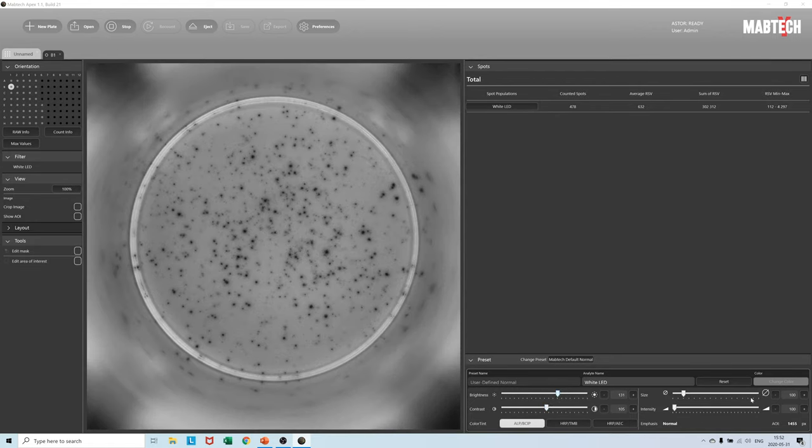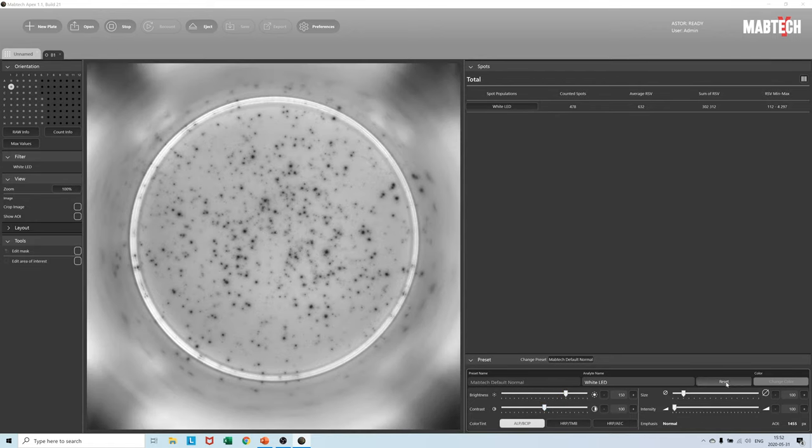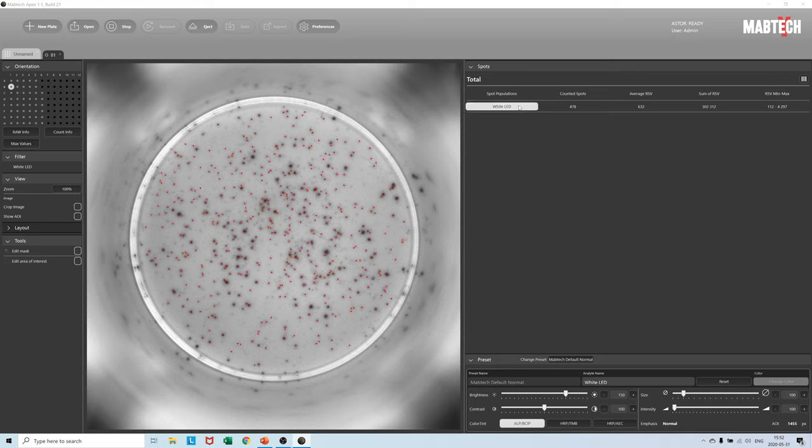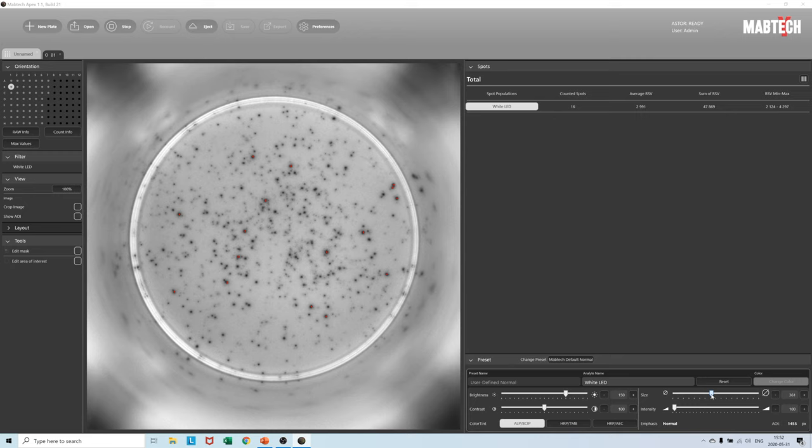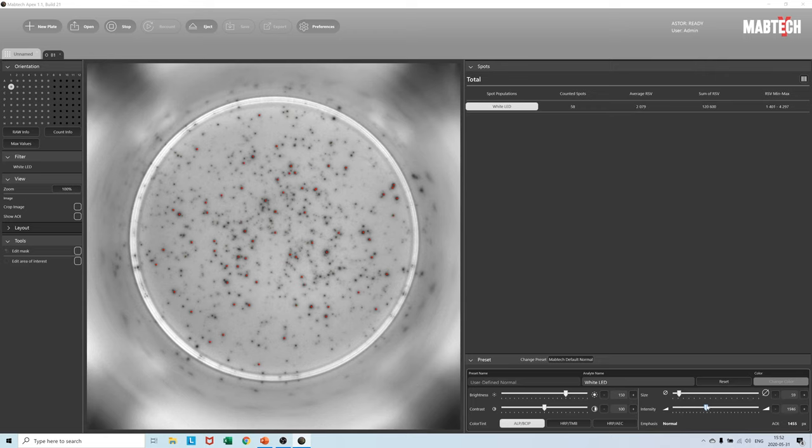Thresholding of spots that you are interested in versus not very interested in is very easy to do. We have provided a Mabtech default setting which you can always return to by pressing the reset button, which is a good starting point for most Elispot experiments.